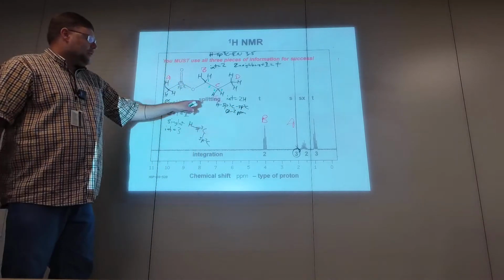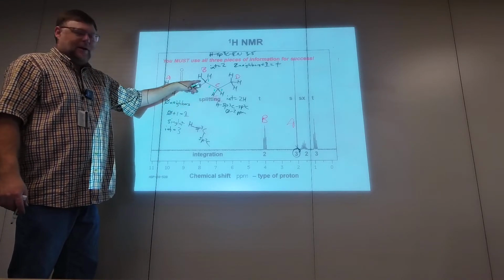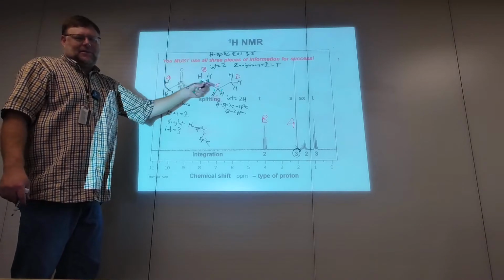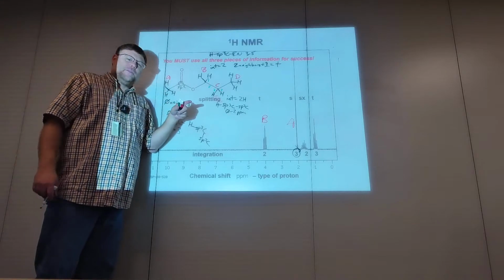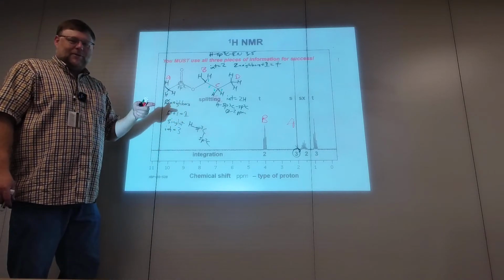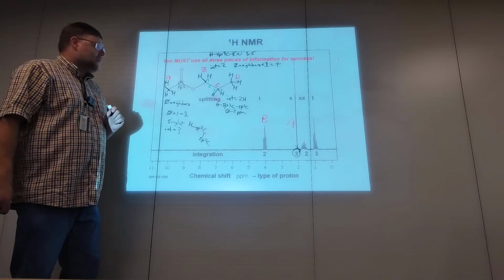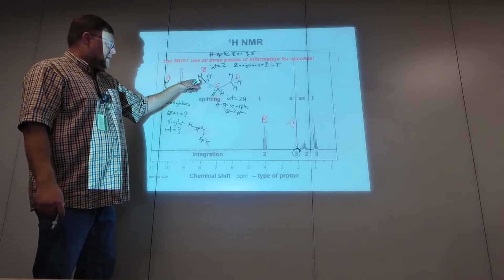And how many neighbors? So now the big question is, how many neighbors do protons C have? Obviously, if C is a neighbor of B, then B has to be a neighbor of C, right? I've got a neighbor named Jim, and I've got a neighbor named Kendall. I am Kendall's neighbor, and I am Jim's neighbor. Jim and Kendall aren't neighbors.